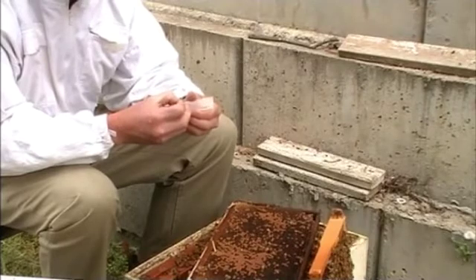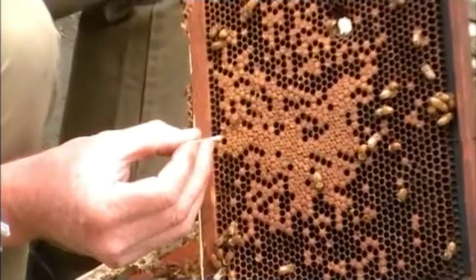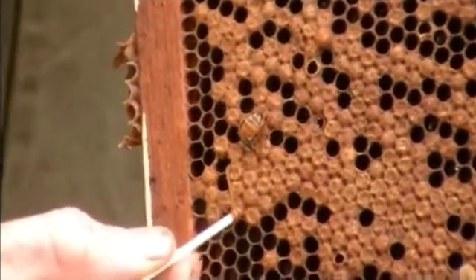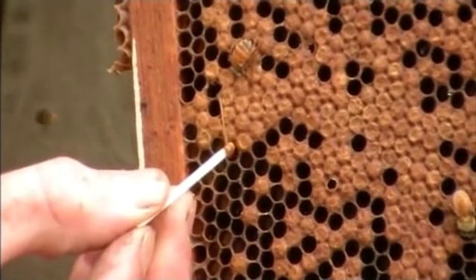The preferred method is to actually make up a microscopic slide — a smear sample as we call them — and that's merely just getting three or four diseased larvae, putting them on the glass slide, mixing it up on the glass slide and removing the excess material, letting it dry, identifying the glass slide as coming from you and the hive number, wrapping it up in some cardboard and sending it off to the lab.